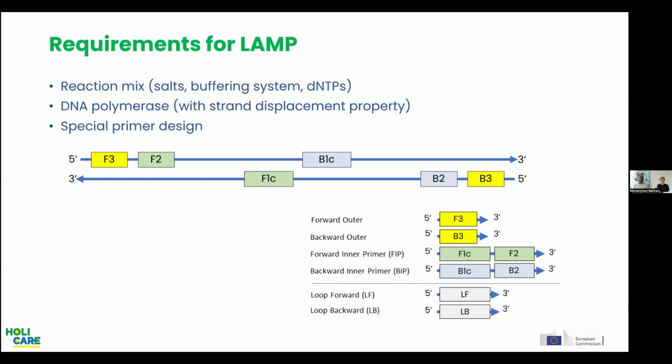The secret behind LAMP and its ability to work lies in these specially designed primer sets, and they enable the isothermal amplification in an automated way under a fixed temperature. Now I would like to just briefly describe these primers, as they are the subject of this.